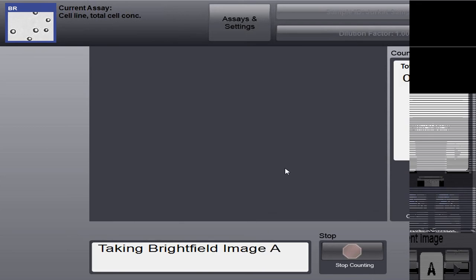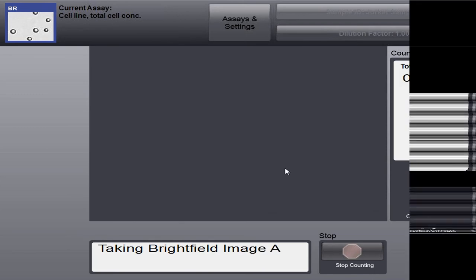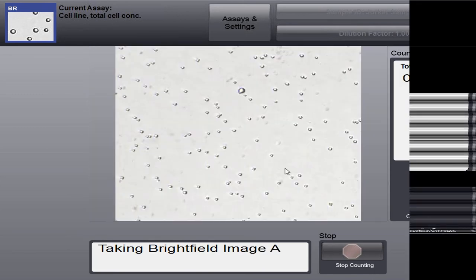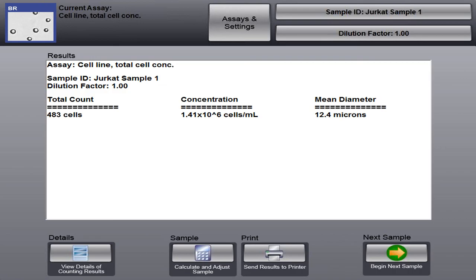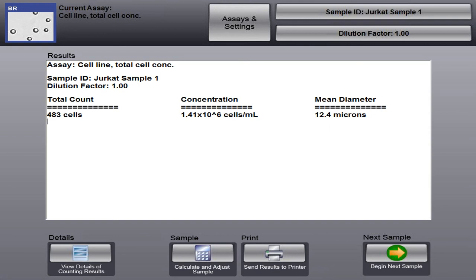So our cells are in focus. Now we can count. So right now the instrument, it's done in two parts. It's acquiring images. So it's taking our bright field A, B, C, and D. And our count is finished. You see it's very quick. So here's our results page. We have a total cell count of 483 cells, a concentration of 1.4 million cells per milliliter with an average diameter of 12.4 microns.